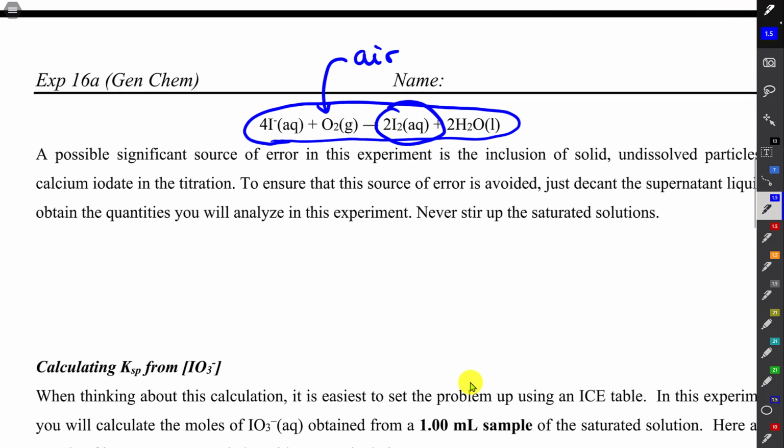So you're going to have a molarity of thiosulfate, we'll just call it M S2O3 2 minus, which is going to be about 0.010 molar. And the exact molarity, you need to check that on the day that we do the experiment because the thiosulfate is not super shelf stable, and so the technician will prepare it in the morning and then titrate it and figure out the exact concentration. So you need to check this value before you get started, and you'll write that number down in your notebook.